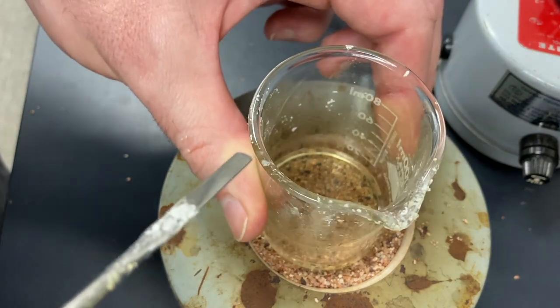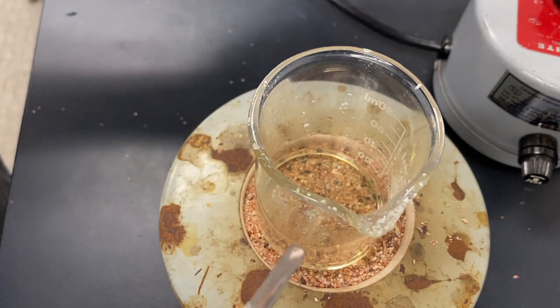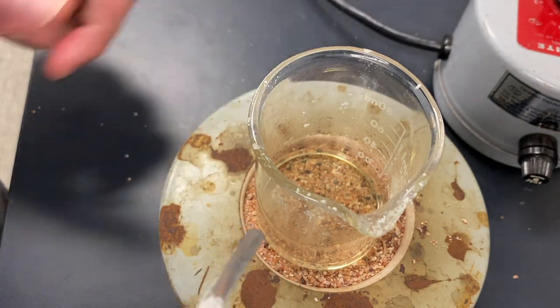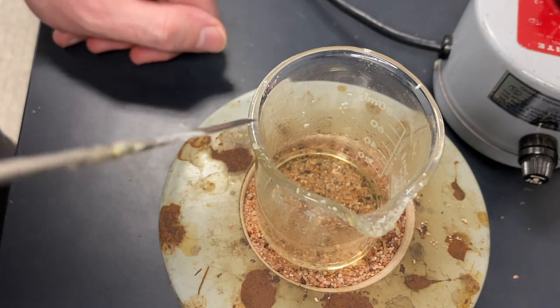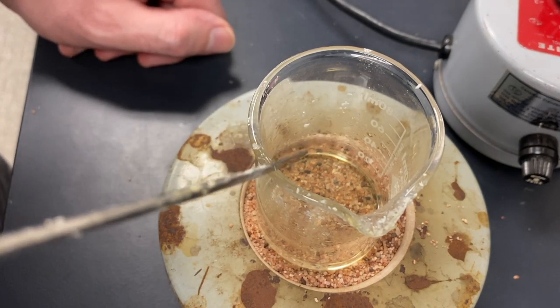That will help drive off just a smidge of the solvent. Then we're going to let this cool down slowly. Don't put it in ice or anything just yet. After it's down to room temperature, then you can put this beaker in an ice bath and let it cool down further.